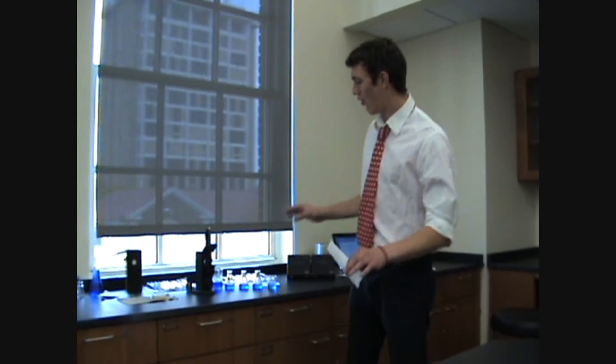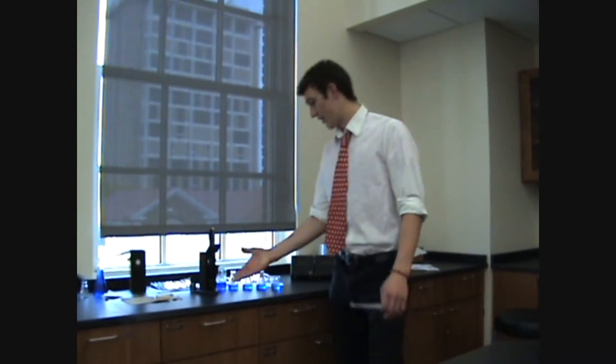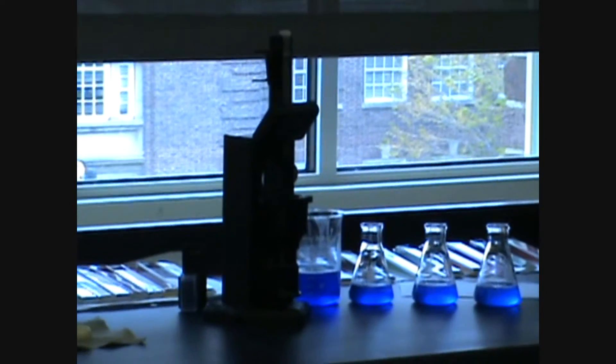Today, I'm going to tell you about a really old way to measure the concentration of something in solution. This right here is the Helige Wedge colorimeter.